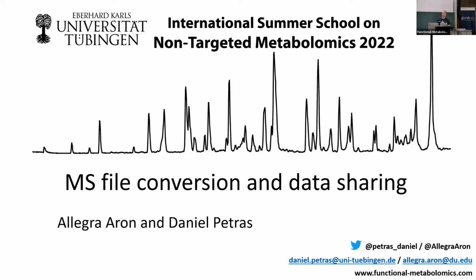So yeah, today we're actually going to start processing data that we generated yesterday at the end of the session, after we fixed the leak and everything. And also data that has been generated by 13 other labs, which we obviously already had available.